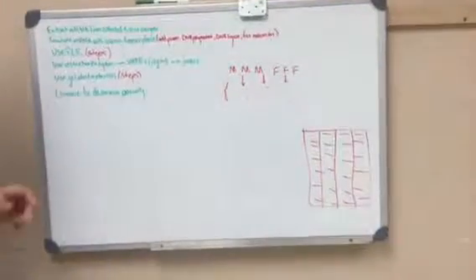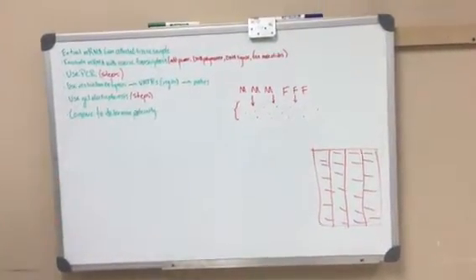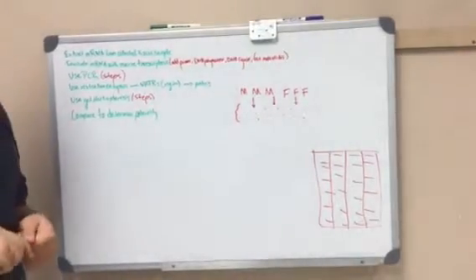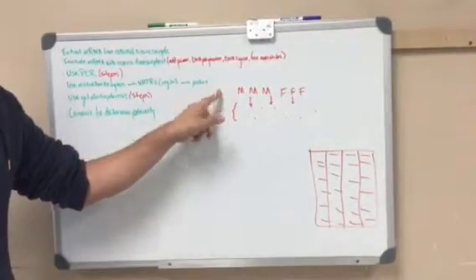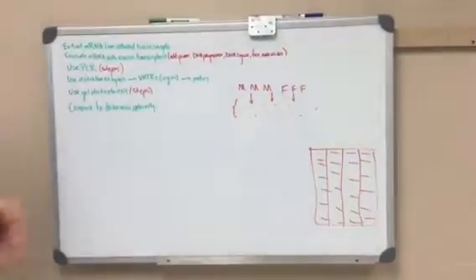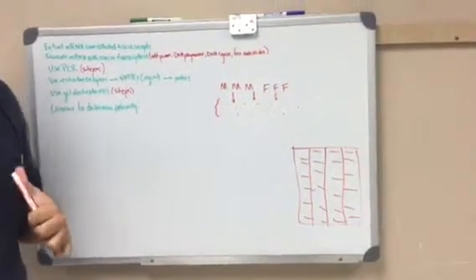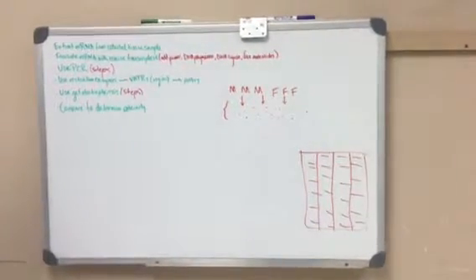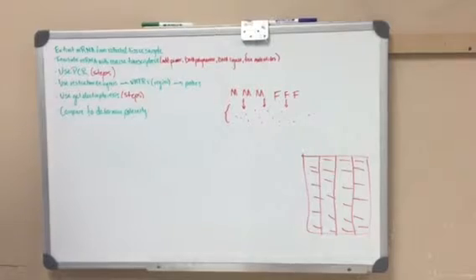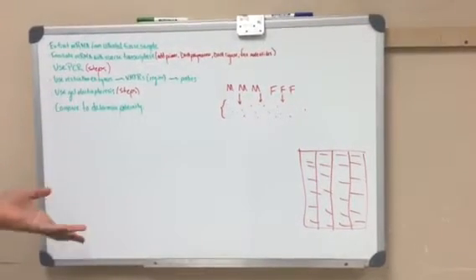So here we're dealing with the problem where we have both male and female lizards, and they all had hatchlings. But what we did was we collected the males and we collected their hatchlings. Now the question that they ask us is, how do we know which hatchlings belong to which father? In order to do this, we need to do many processes to determine paternity and basically do DNA analysis, perform that in order to determine paternity.